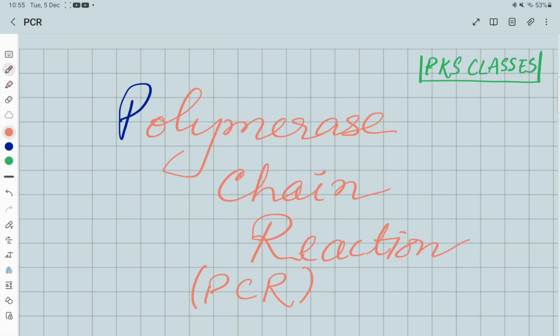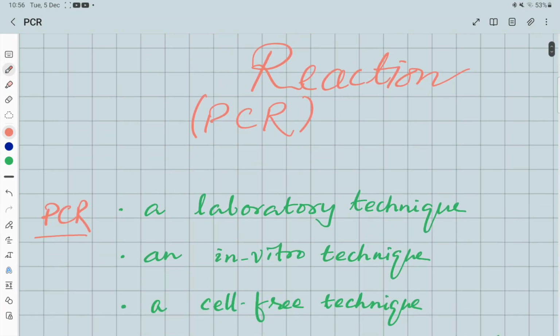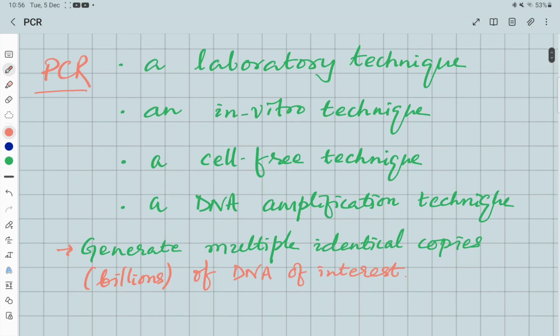Today we are going to study polymerase chain reaction. We also know it as PCR. This PCR is a laboratory technique, an in vitro technique, a cell-free technique. We do not need a cell.